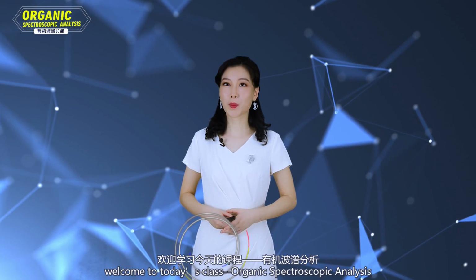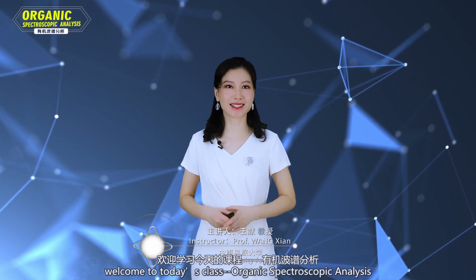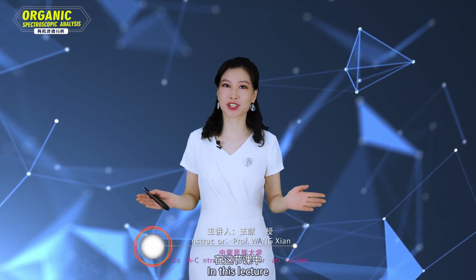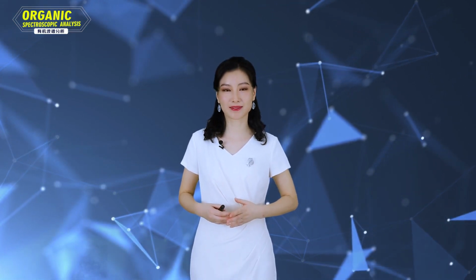Hello everyone, welcome to today's class, Organic Spectroscopic Analysis. In this lecture, let's learn a new spectrometry technology, which is mass spectrometry.